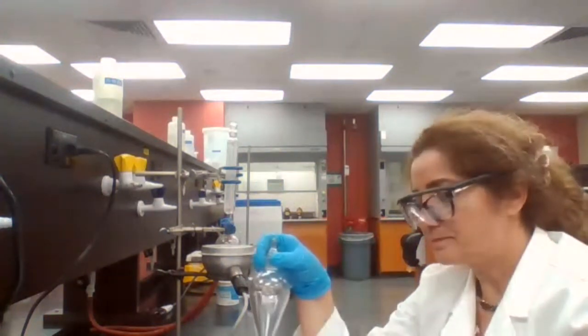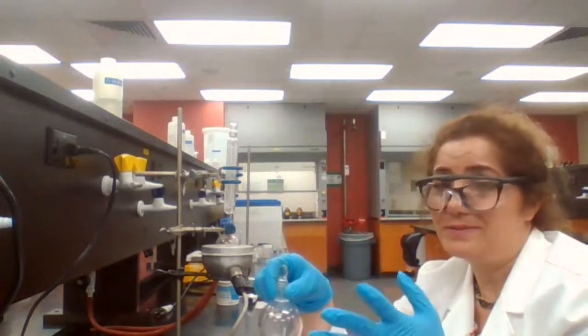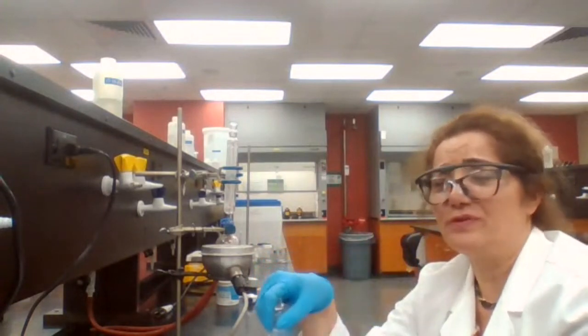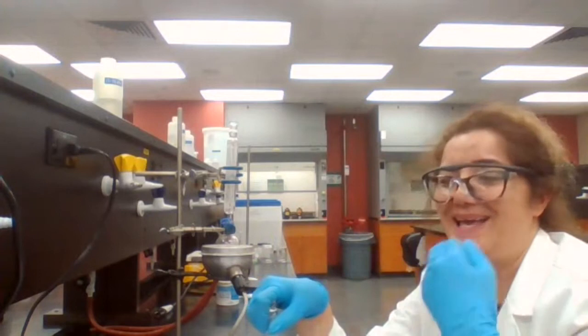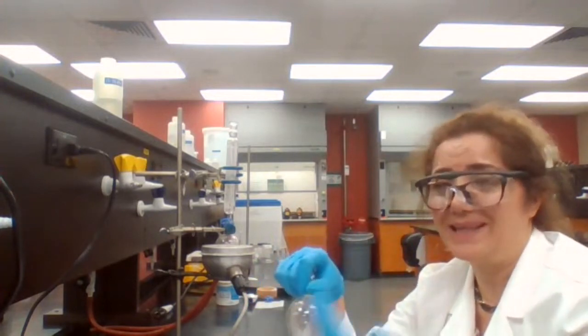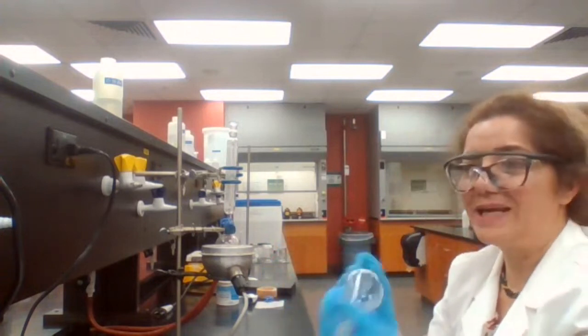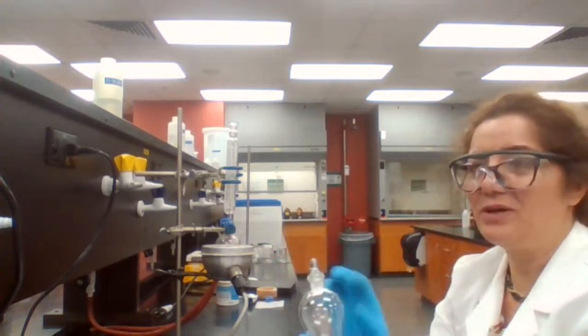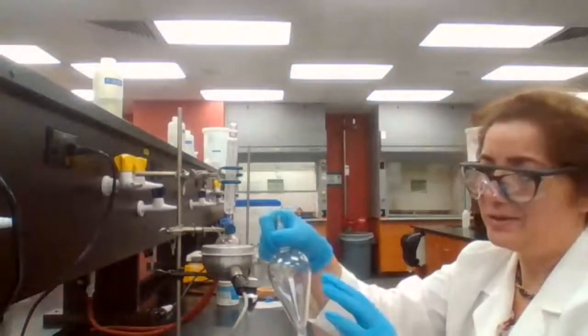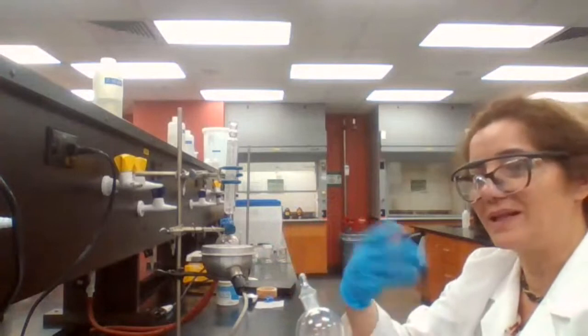In the extraction, there are 3 terms that I use to make it simple for students to remember, and it must be done every time. So for consecutive extraction, you have to shake it. And when you are shaking, it depends on whether you have a chemical reaction or you're trying to wash, you want to avoid emulsifying it. So you don't have to shake it really hard, but you have to do that at least 2-3 times.